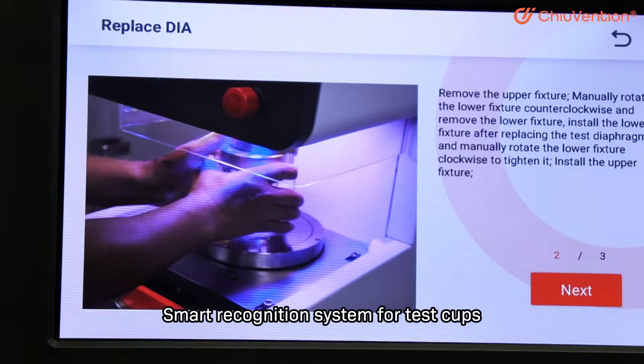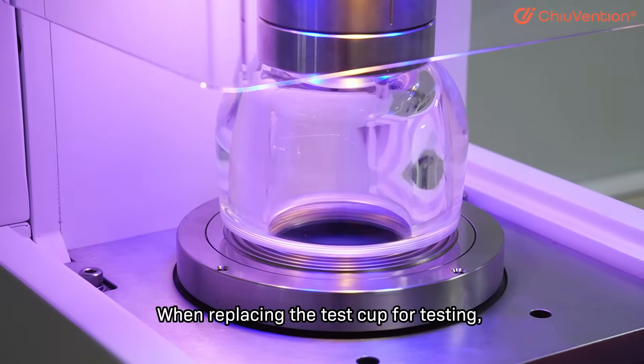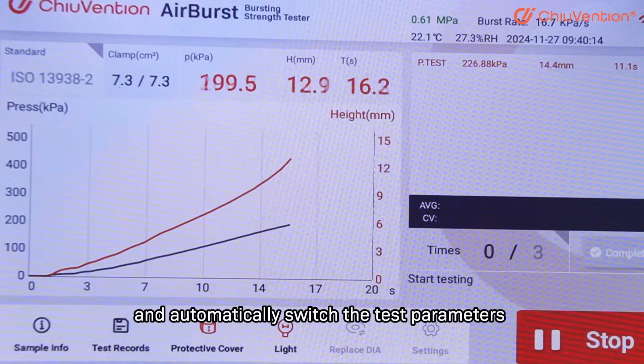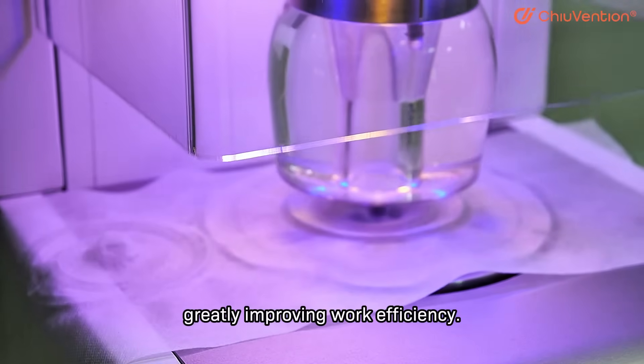When replacing the test cup for testing, the system will automatically recognize the model of the current test cup and automatically switch the test parameters without manual input changes, greatly improving work efficiency.